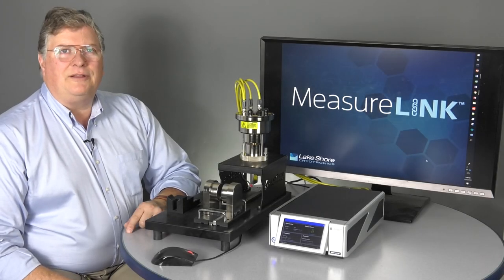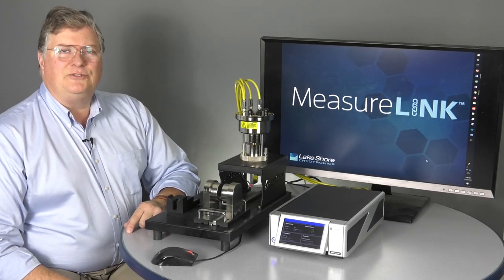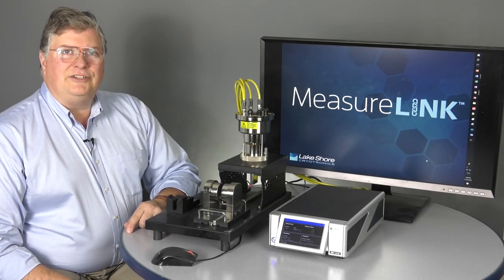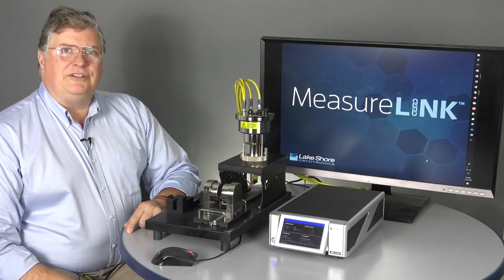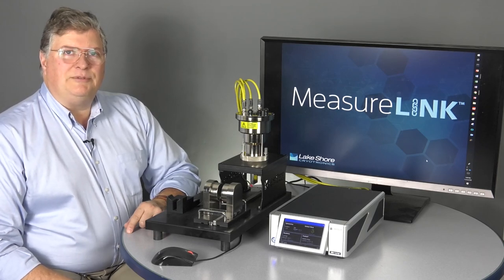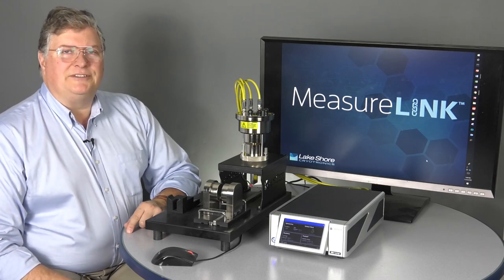I'm Kevin Carmichael, product manager here at Lakeshore Cryotronics, and today we'd like to do a demonstration of Lakeshore's new tabletop hall measurement system.